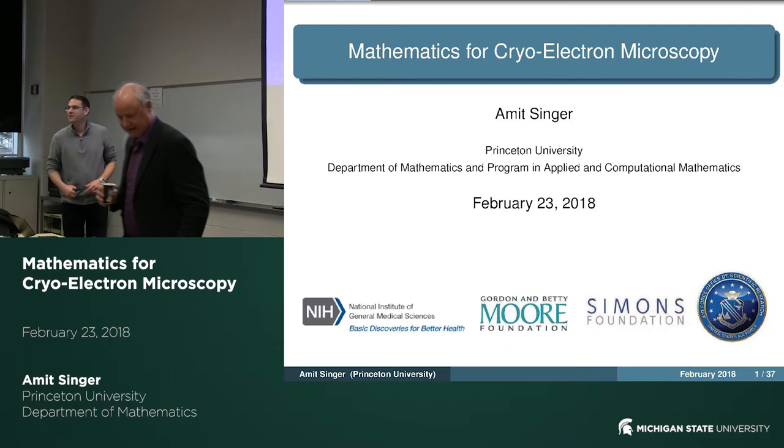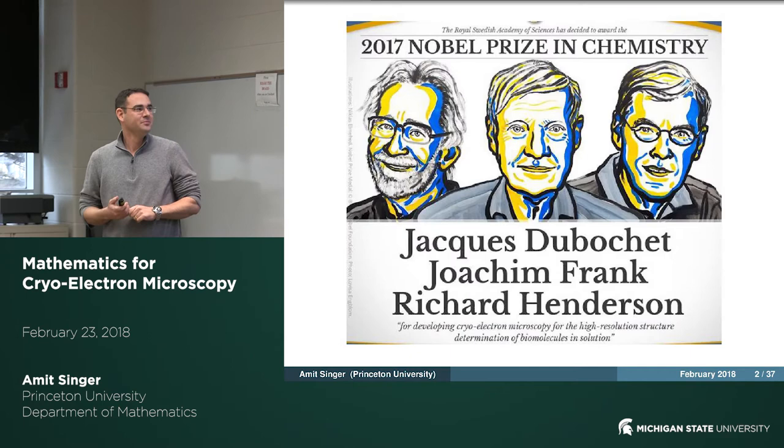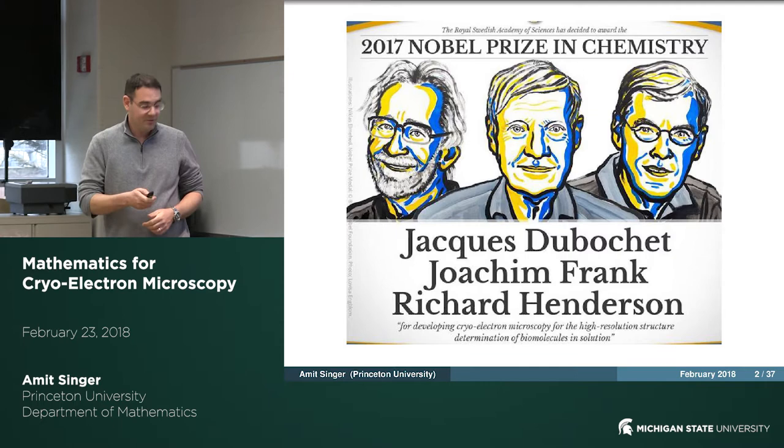So today I'd like to give you an introduction to cryo-electron microscopy, but from a mathematician's point of view. Cryo-EM has recently made big news due to the very recent Nobel Prize in Chemistry, awarded to three of the pioneers in cryo-electron microscopy development and studies. If you read here, it was for developing cryo-EM for the high-resolution structure determination of biomolecules in solution.